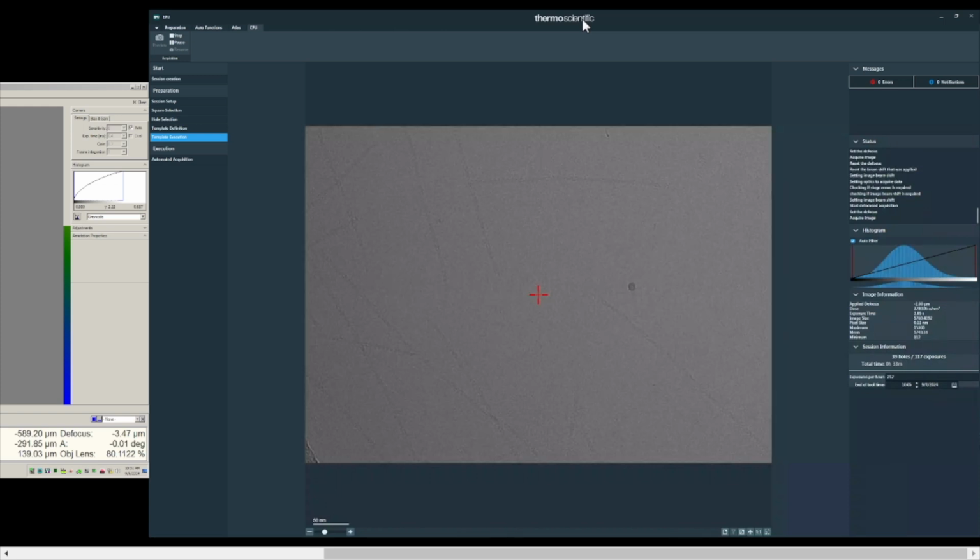Now we can see the first exposure. This is a filament sample instead of regular single particle data. So the second shot. The third one too. Okay, then we can go back to select more squares and holes. Then after all the targets are selected, we can start the automated data collection.